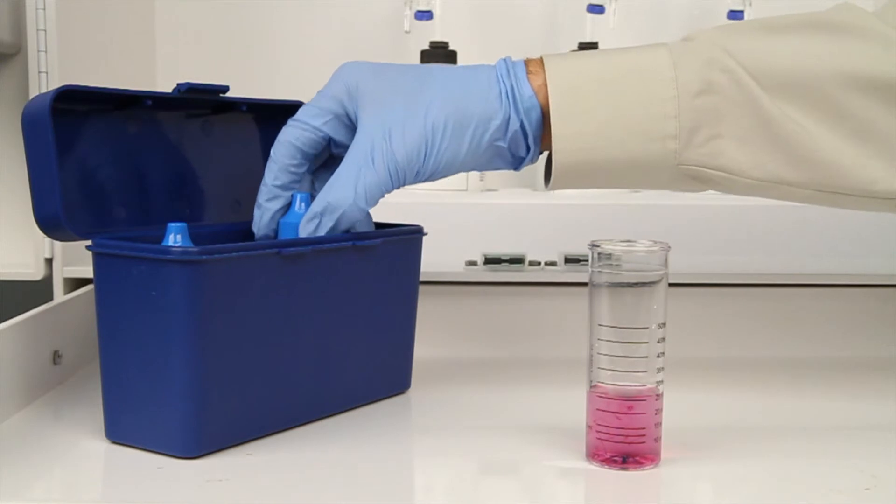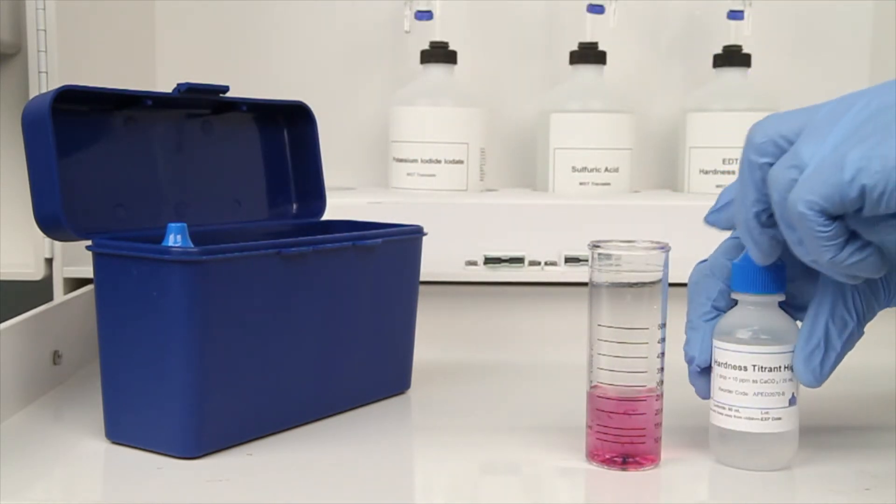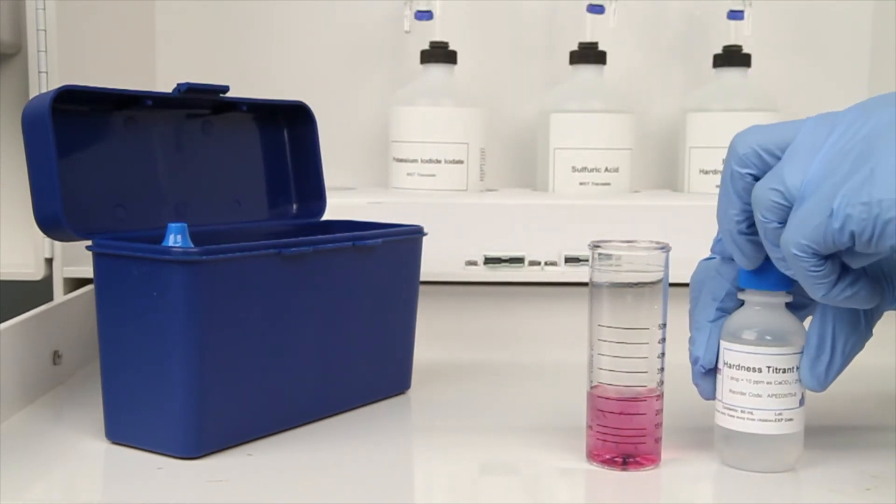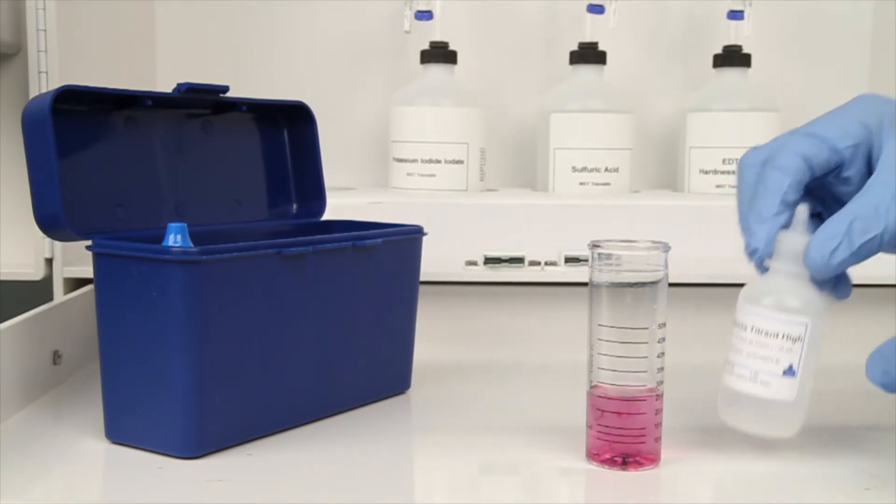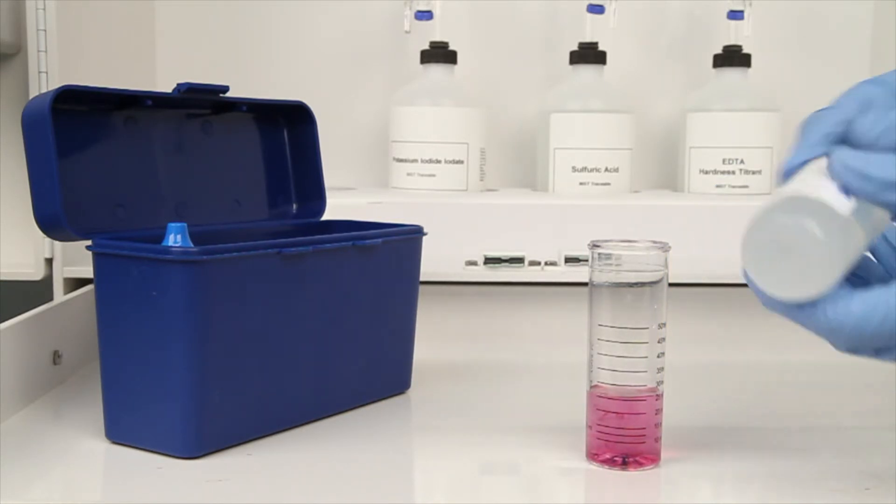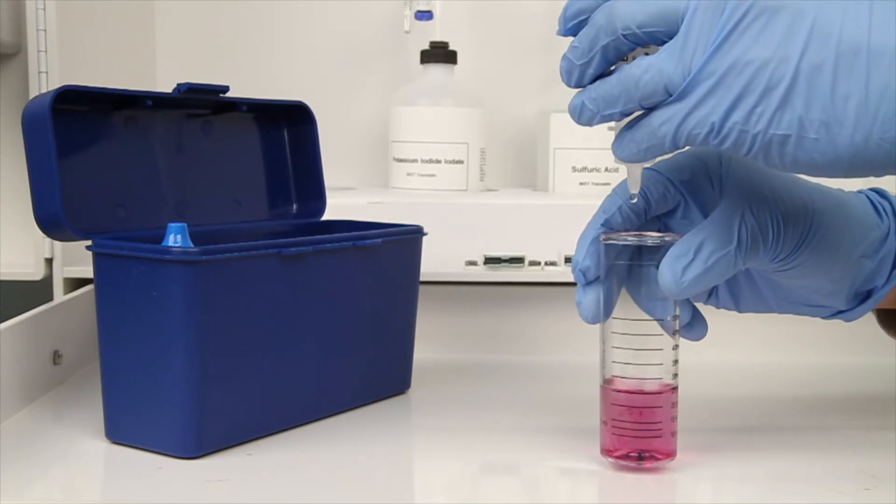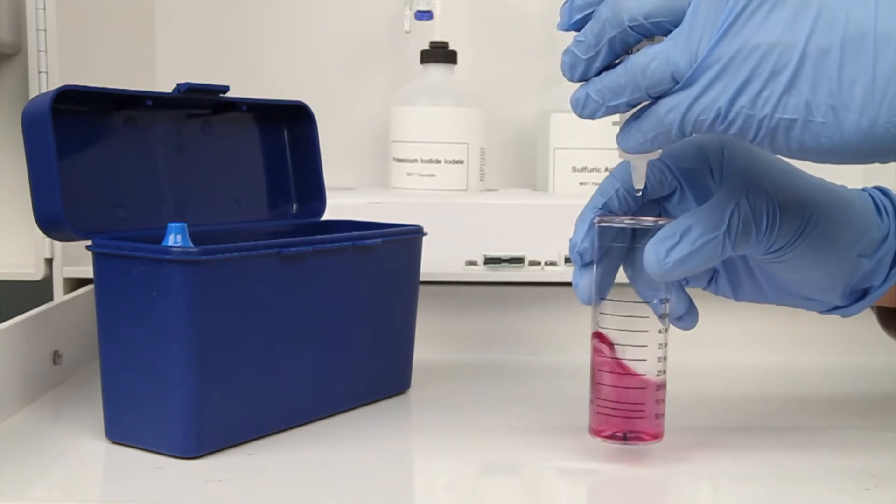The next step according to the Endpoint ID procedure is to perform the titration. Each bottle of titrant is labeled with the equivalency and sample size it was manufactured for. It's important to make sure you have the proper titrant and the proper sample size for this titration.